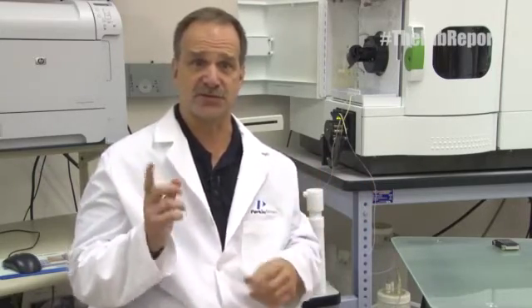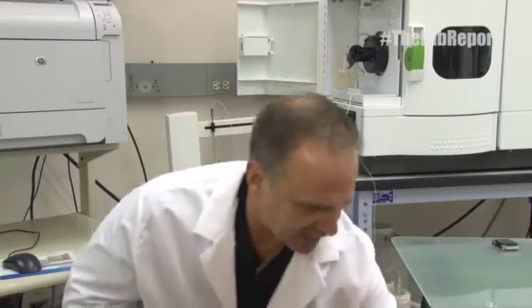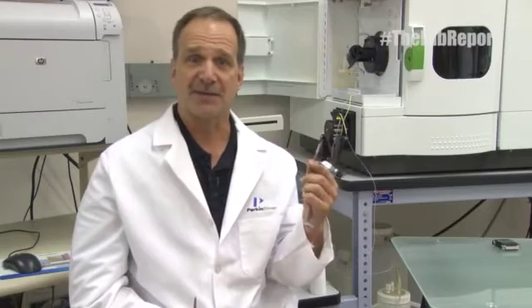We're also going to look at the sample preparation steps required to bring this huge variety of sample types into solution. So let's start with some examples of electronic equipment. We can have used cell phones, we can have circuit boards, we can have connectors, we can have all of this sort of material that we can use to test.